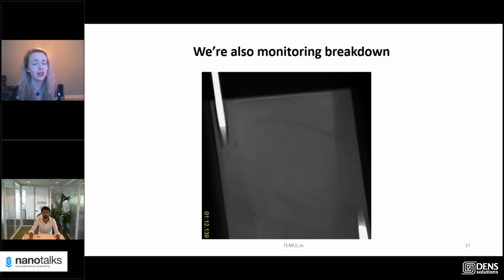For in-situ heating, normally what I would do is never put down any platinum and just drop the lamella down onto the chip, never applying any contact in the FIB. That was the old way I used to do it, with a carbon protection layer. But I don't know what your experience is. I haven't tried to just drop it down or not use a contact between the FIB lamella and the contacts on the MEMS chip itself.